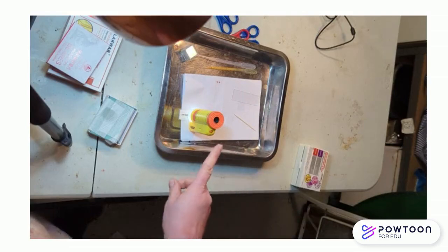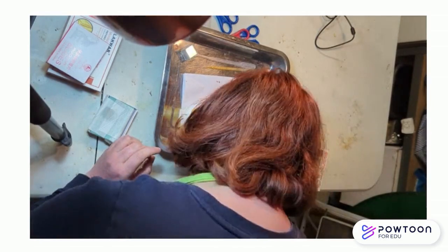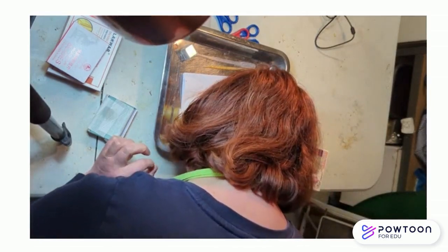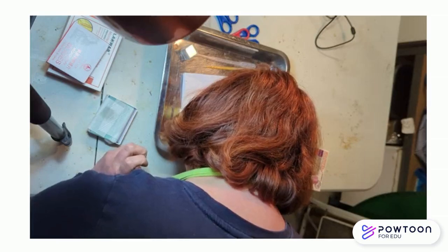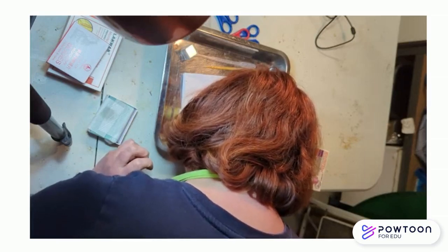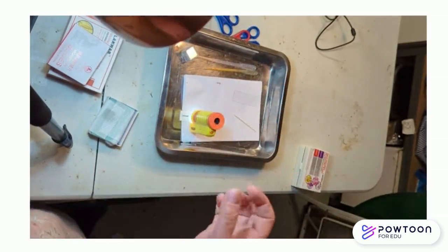And it's not easy. It's taken me about 5 minutes, literally, just to bend over and find the right magnification and the right focus. And now I can see actually the section of an onion in a beautiful blue. I can see the focus, I can see the wall. It really is very clear.